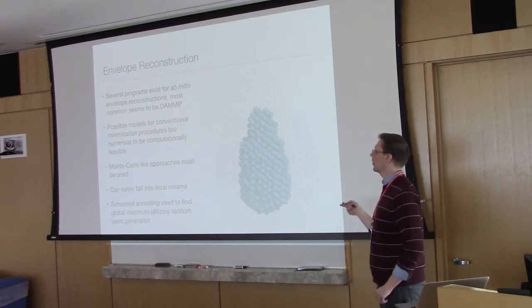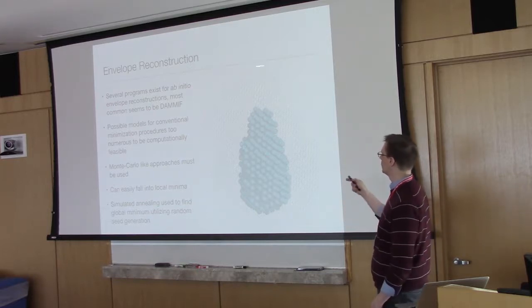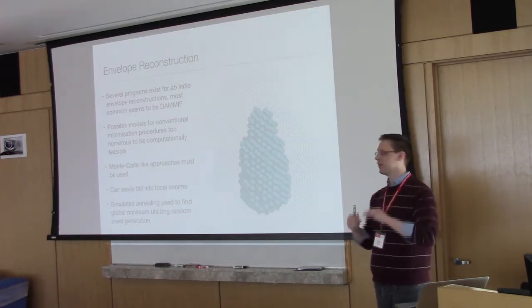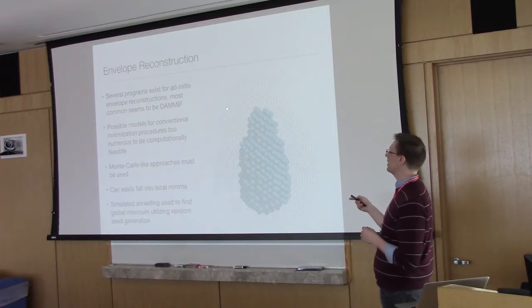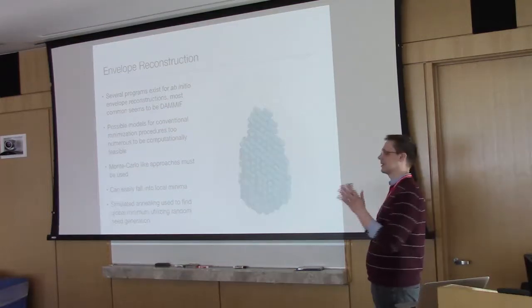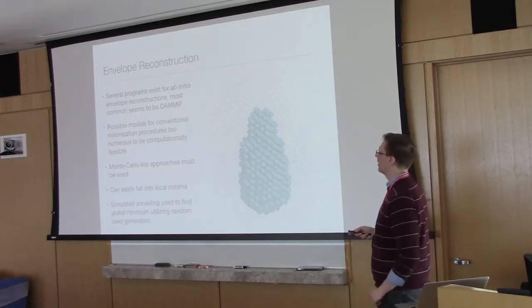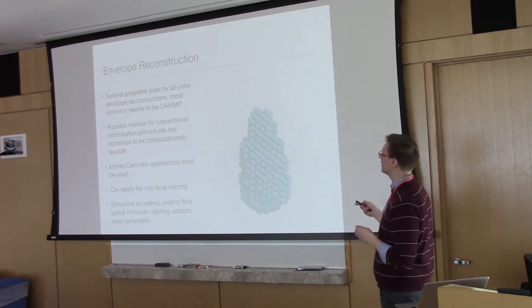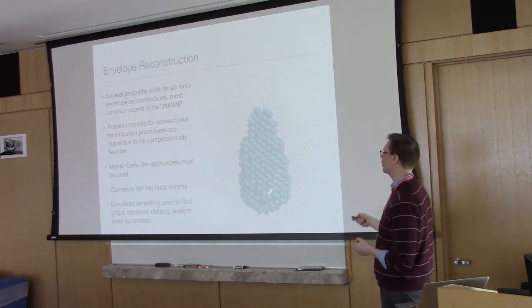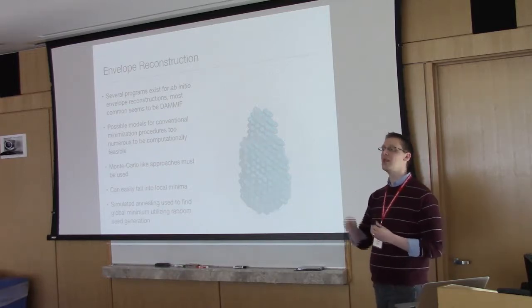The way that these programs work is that they fill space with a bunch of beads, sort of a hexagonally packed, tightly arranged grid of beads. And they turn the beads to either be solvent or particle. It starts with a random configuration. I don't think it's entirely random, they have some kind of connectedness thing to them, but it's effectively random. The idea is they change one bead at a time to be either solvent or particle. Then they calculate what the scattering profile of that collection of beads is, and they compare it with your experimental data. And they do this millions of times.